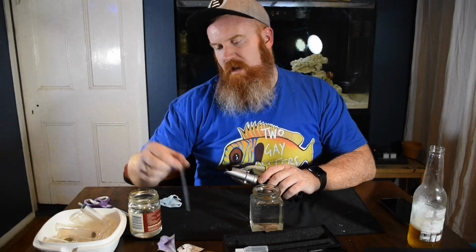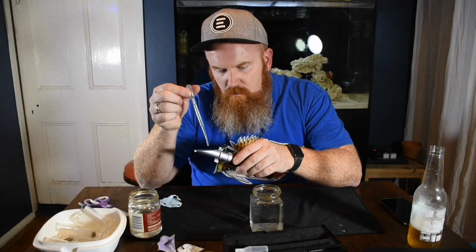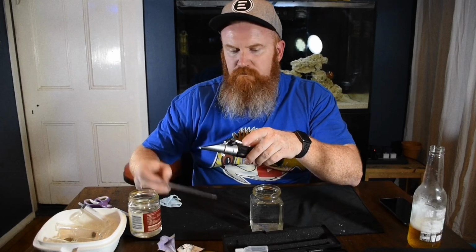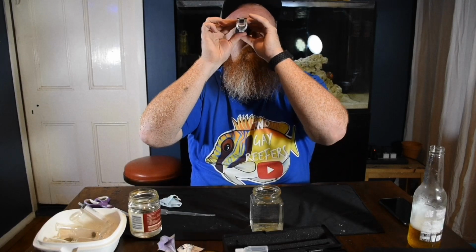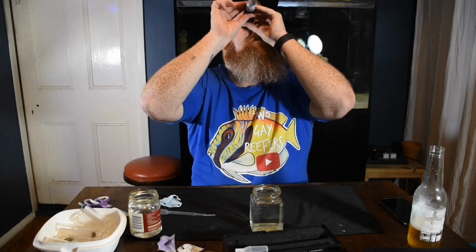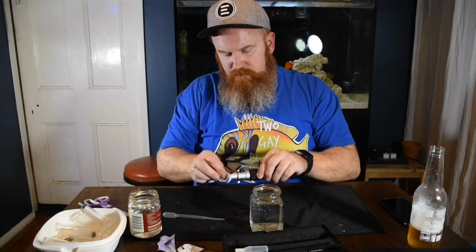Alrighty, grab the same pipette. Now I always just run a bit of salt water through it a couple of times just to make sure I'm not putting any RO on there to get a false reading. Put a couple of drops on there. Look up towards the light. And we are getting 1.025, exactly where we want our salinity to be. So that means we're nice and happy. Grab some RO water, give it a nice clean, give it a dry off.